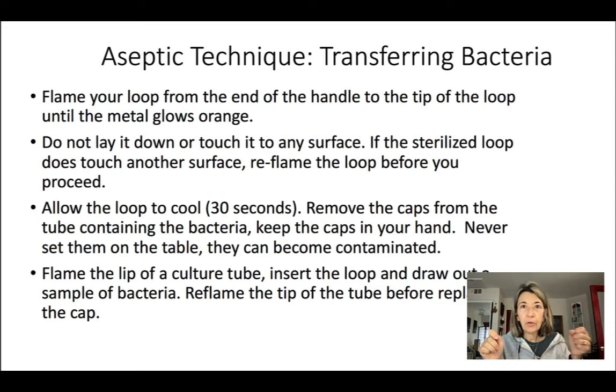Then you take the tube with the bacteria, and there is a way to do this, and so I'm holding the tube, and then with my pinky finger, I'm still holding the loop here. Actually, let me hold a pen here. So I'm holding the loop here, and then with this little pinky finger, I'm holding the cap. Then I flame the tube. All right. So now I'm still holding the cap. So now I go in the tube. So now I have the bacteria in the loop, and then I flame my tube again, and I cap.